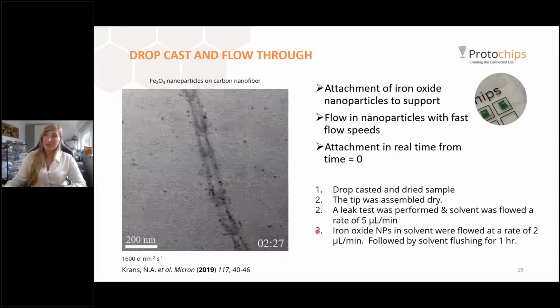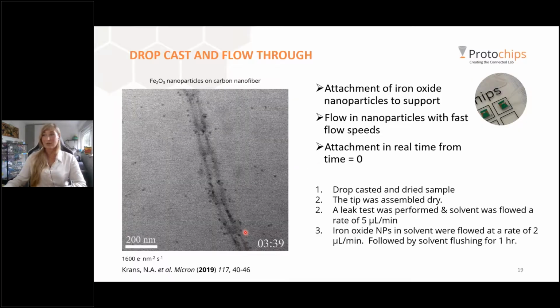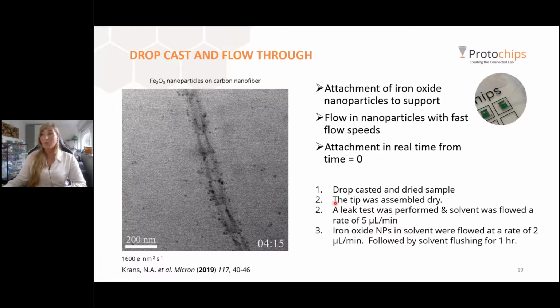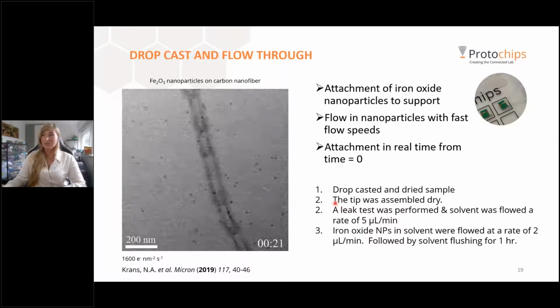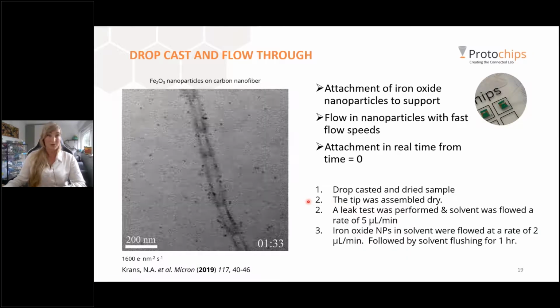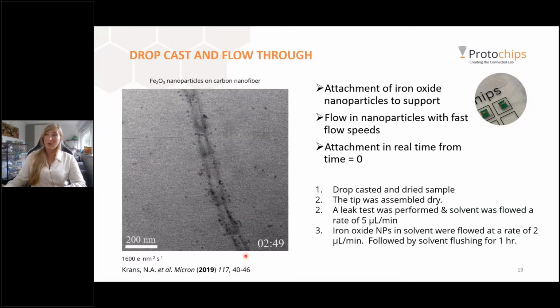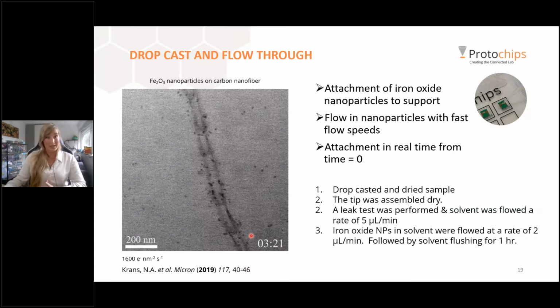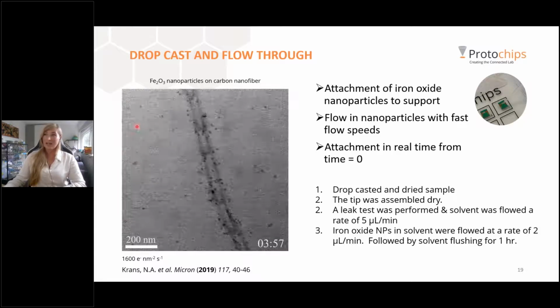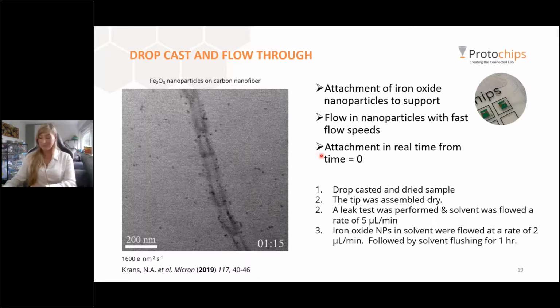And because we're flowing through our particles from time 0, we can really see how the self-assembly occurs and what is the optimum amount of nanoparticles to put on these fibers, and get a bit more conclusions on how these nanoparticles interact with this nanofiber. So this is a very nice way of seeing what it looks like to have something drop casted and in place without moving, and some other things moving around, so you cannot even see the particles coming by because they move so quickly.